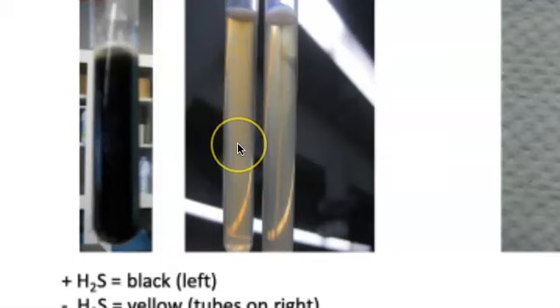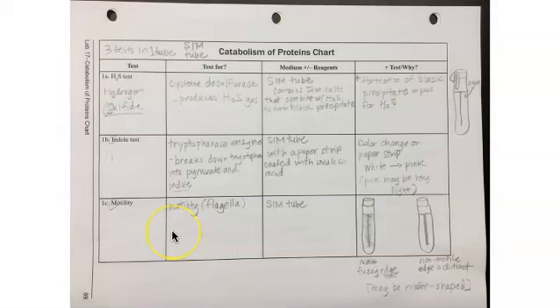As the bacteria move away, they cause cloudiness in the growth medium. So the fuzzy tube is positive for motility. The non-fuzzy tube is negative for motility. So you can look over this table to summarize what we've talked about.